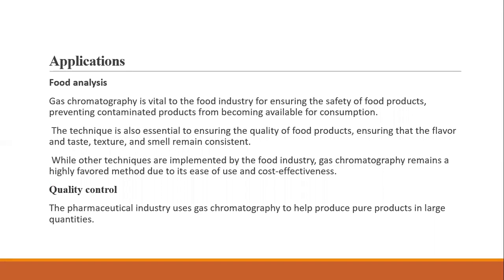The food industry basically relies on the technique of gas chromatography for several applications, including the quantitative and qualitative analysis of food, the analysis of food additives, components of flavor and aroma, and the detection and analysis of contaminants such as environmental pollutants, pesticides, fumigants, and naturally occurring toxins.